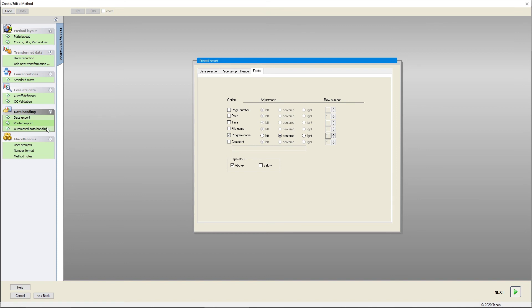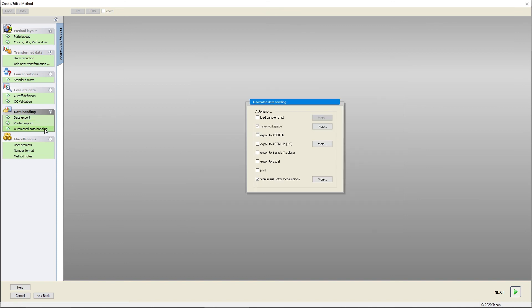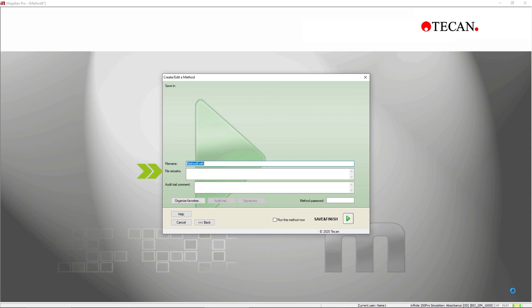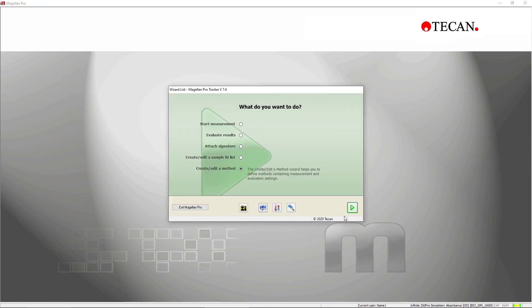The Automator data handling section enables the activation of Automator printout or export. Finally, you can enter remarks, name and save your method, which you can then use at any time.